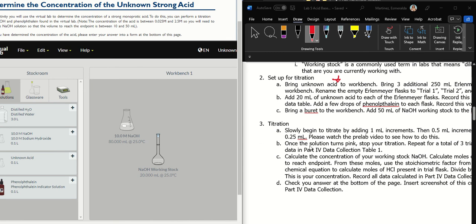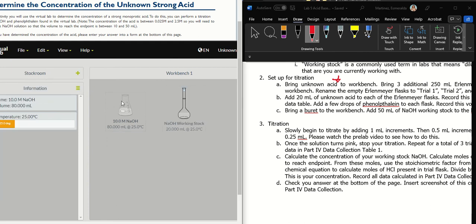Now, you're going to actually complete the titration. So you're going to begin by titrating in 1 ml, in 1 ml increments. So what do we mean by titrating? You're just adding in that amount to your acid. Okay. So I'm going to pause here for a bit and kind of get it semi set up to show you this.